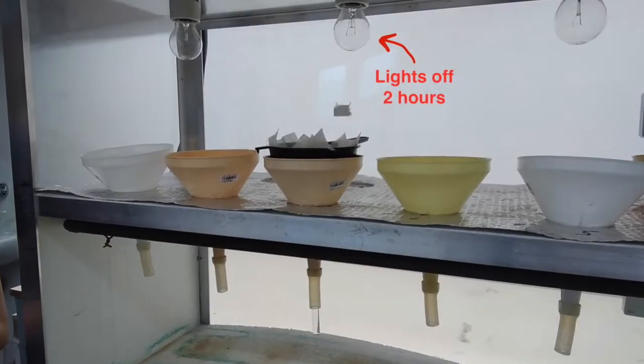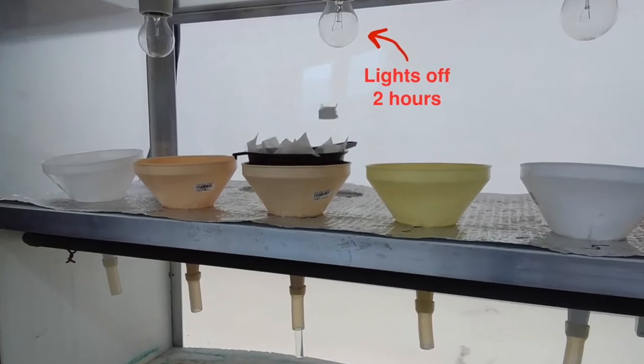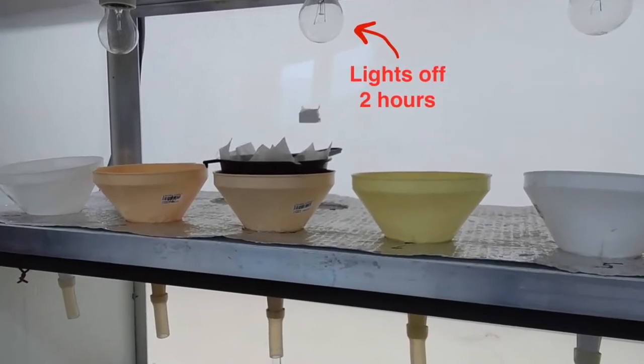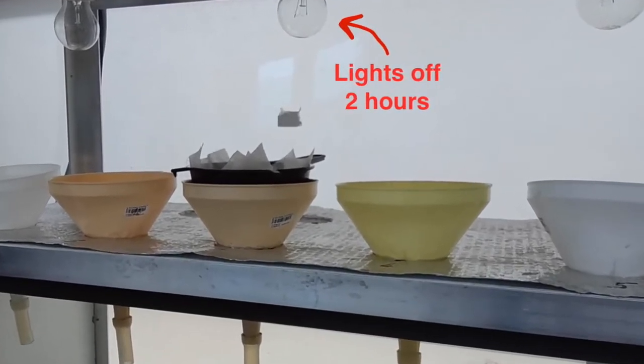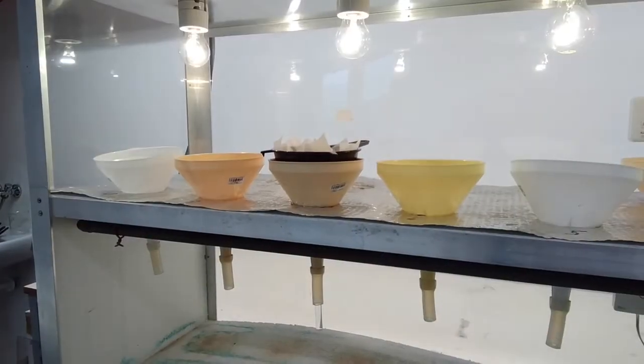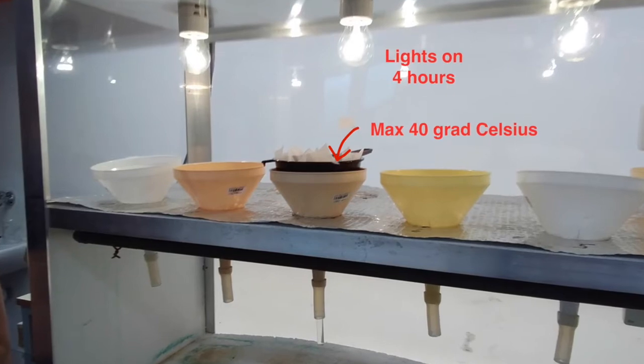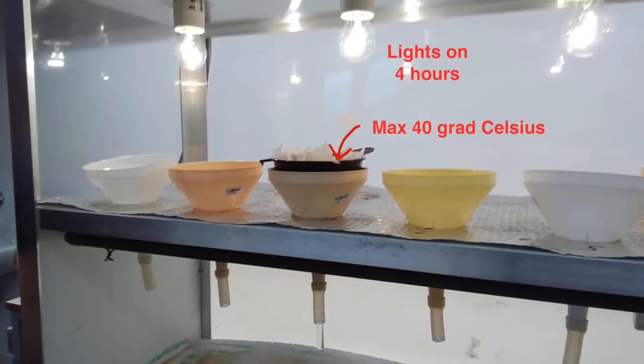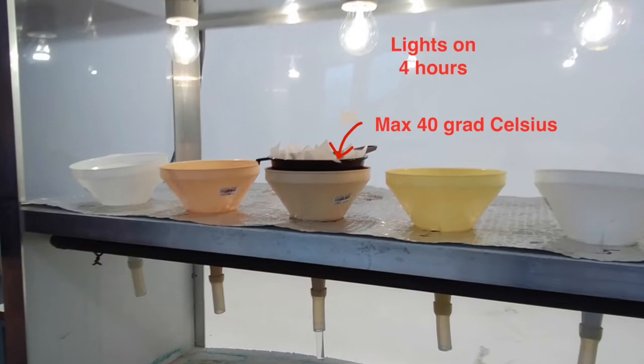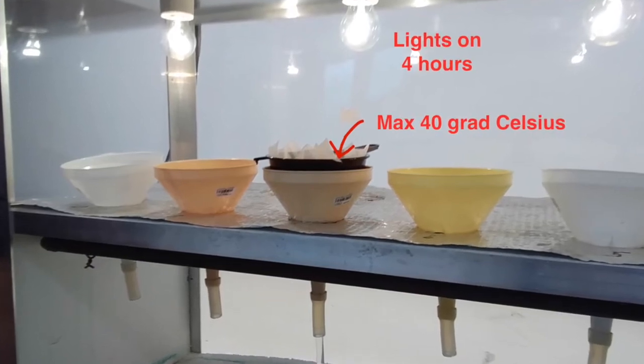The extraction is first run at room temperature for 2 hours with lights off without a heat source. After 2 hours, we switch the lights on and continue extraction for another 4 hours. The temperature in the upper part of the extractor should not exceed 40 degrees Celsius. Control the temperature with a thermometer.